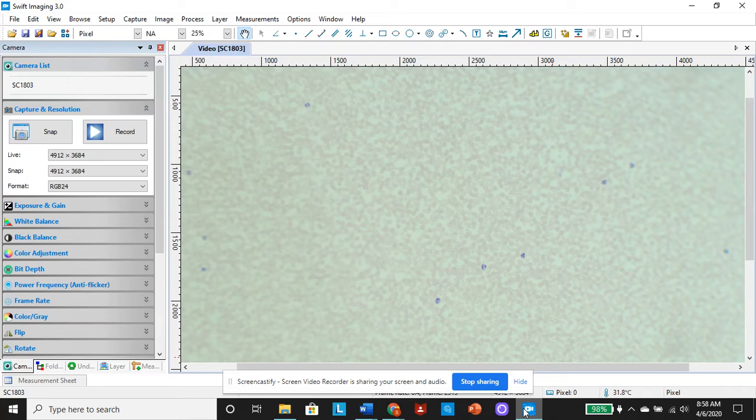A marvelous Monday morning to all of you biologists out there. Today, I thought we would look at some human blood.